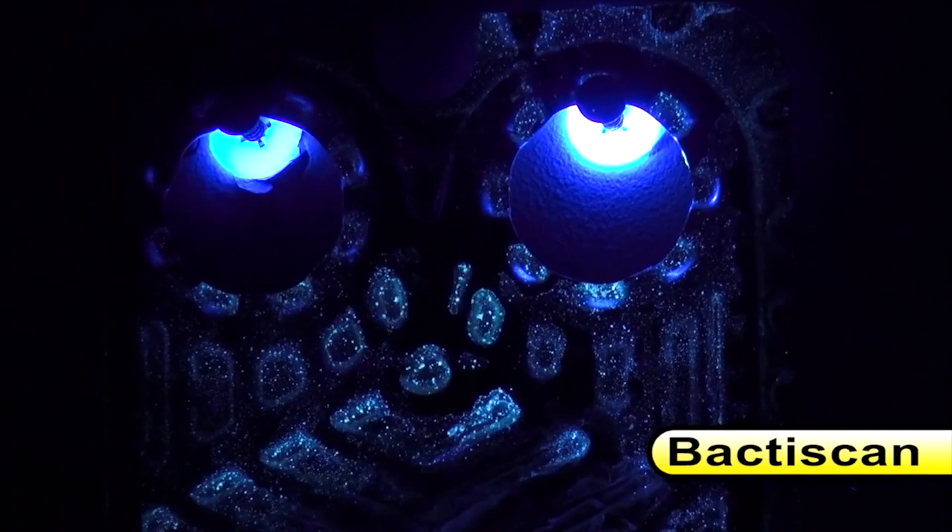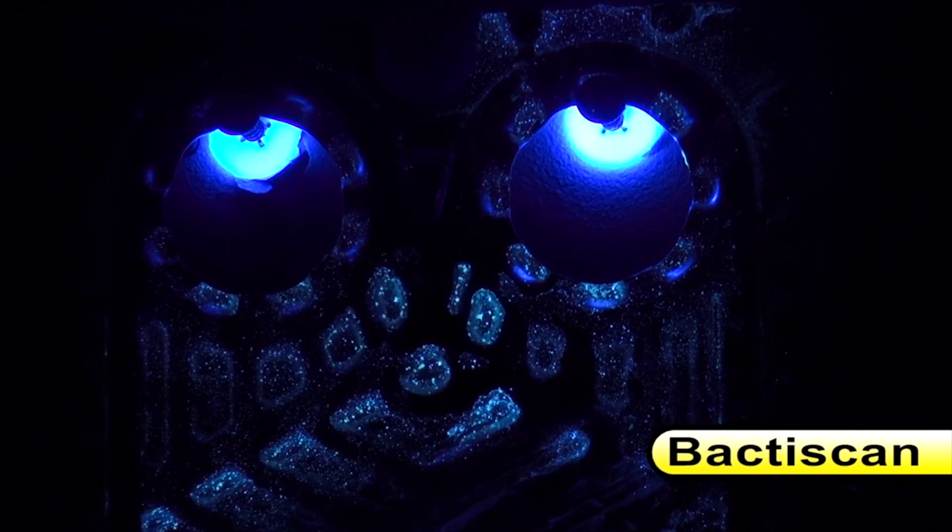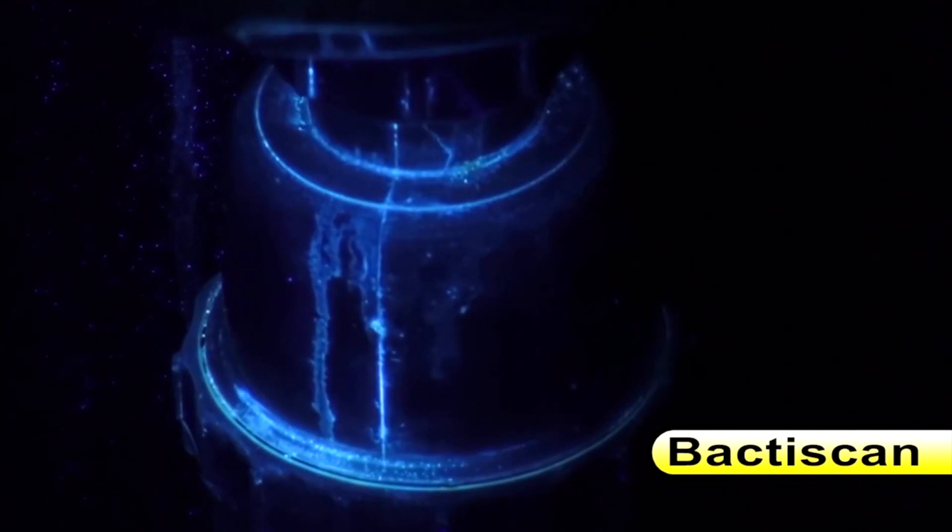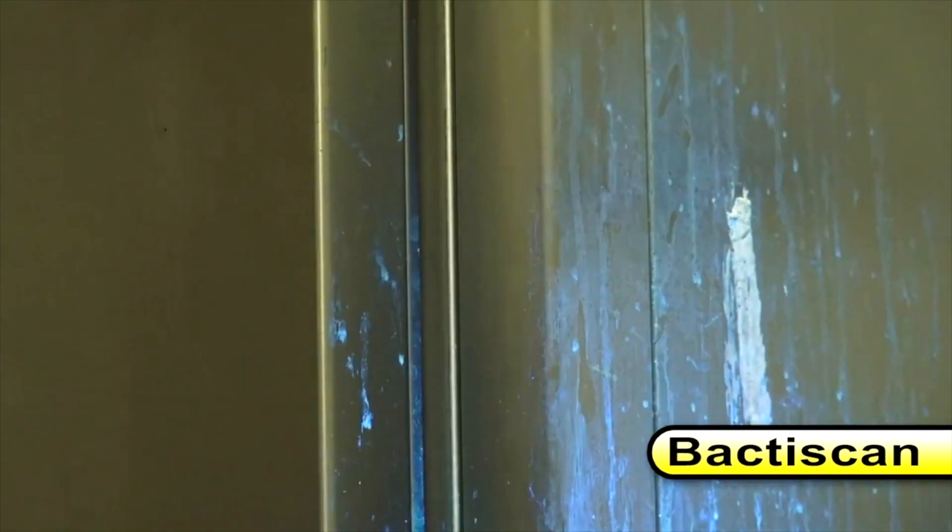Biofilms, mold, bacteria such as Salmonella and E. coli among many other contaminants are easily located and identified with Bactiscan, which makes the remediation job much faster and therefore more cost effective.